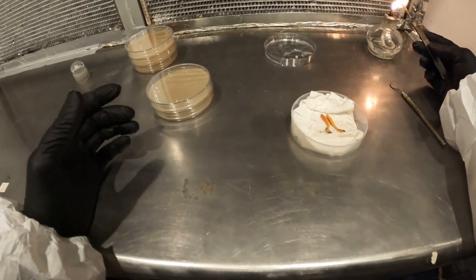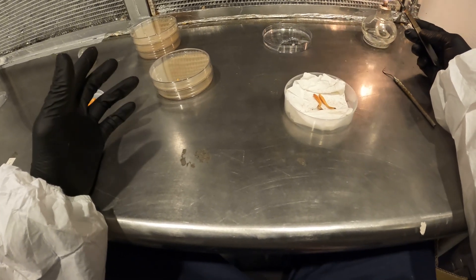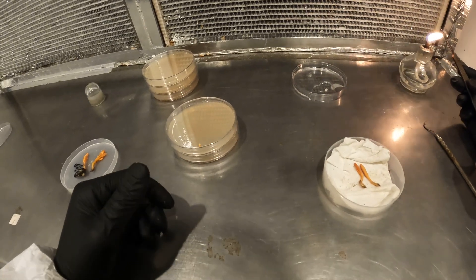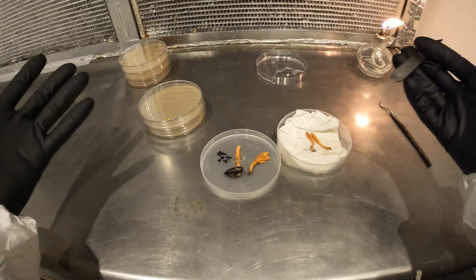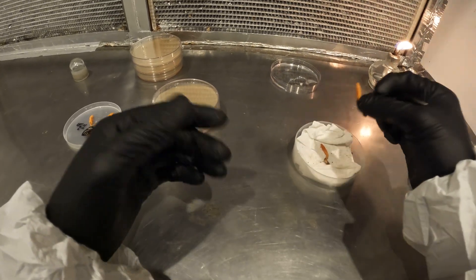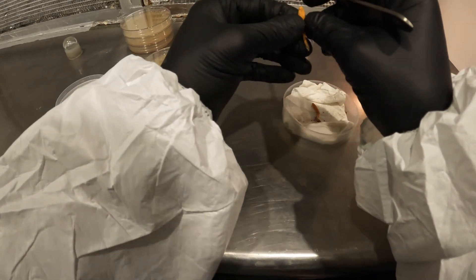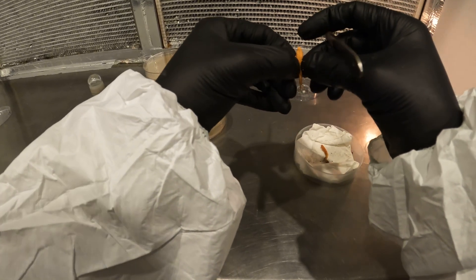From a harvesting standpoint, trying to gather these things from the wild, you're usually not going to find enough to do anything meaningful with. A lot of cordyceps have water-soluble compounds, so maybe if you ever did find a bunch you could make a tea. But it's just not likely — it took me about four days to get these few specimens. What I'm getting at is you can collect your samples from the wild, build your tissue library from nature directly, and then just regrow it. These things are really easy to grow; you just need to know what to put in there.